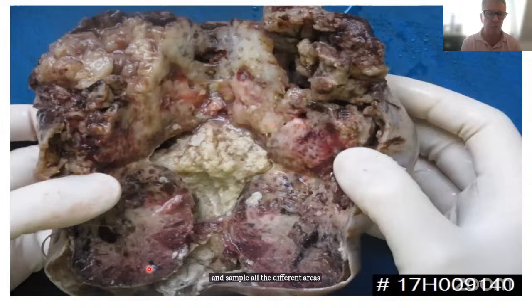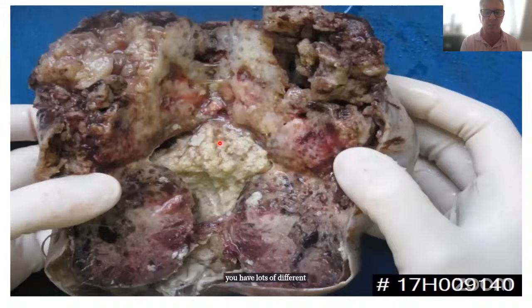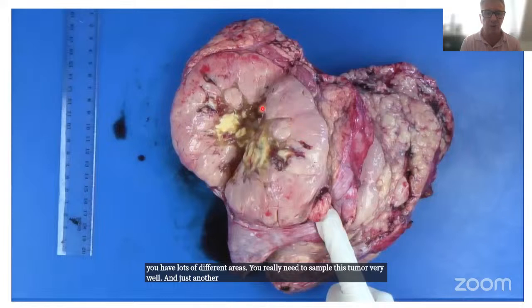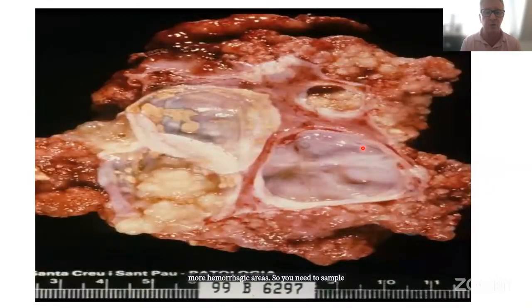Similarly here, you have hemorrhagic areas, you have lots of different areas. You really need to sample this tumor very well. And just another example where you have tumor and then you have areas of necrosis and more hemorrhagic areas. So you need to sample these tumors very well.